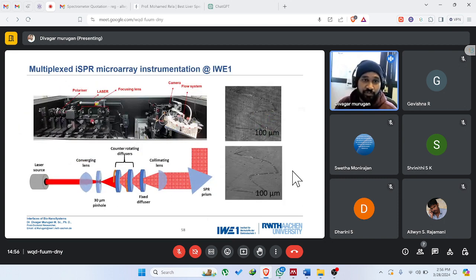Then I was talking about the SPR system, and we wanted to convert this into an SPR imaging system. Previously, you have just seen a graphical representation of how an SPR system is set up. You simply have a prism, and then I just showed a glass chip and mentioned there is a light source and a photodetector. But this is how a usual research-based SPR system looks like.